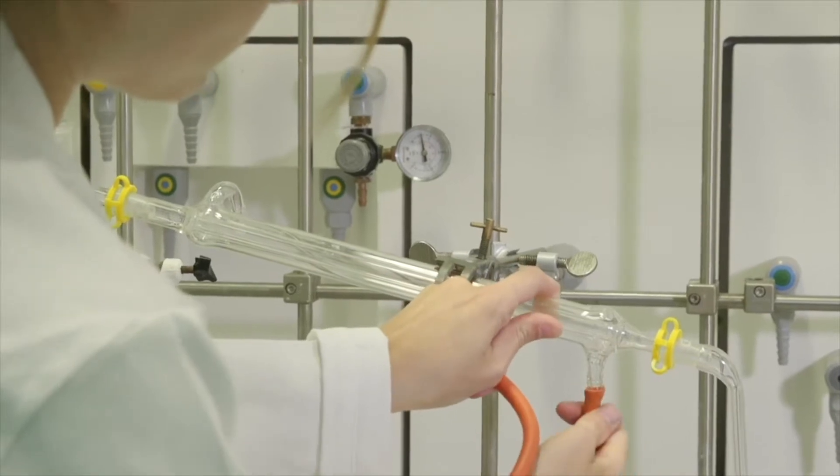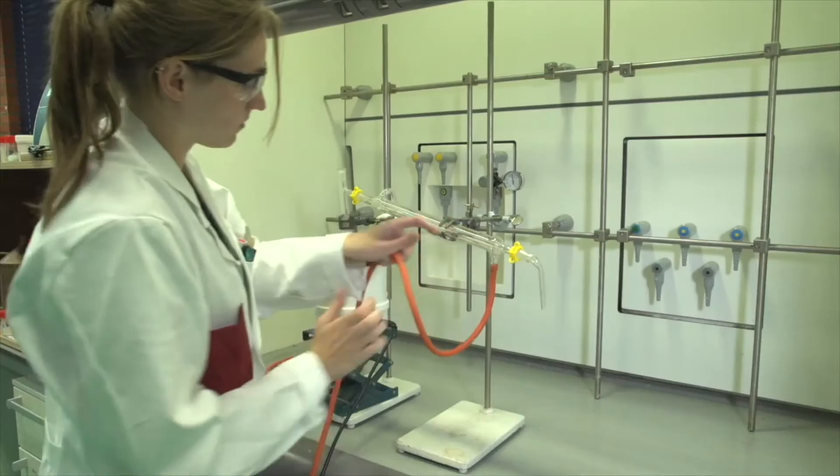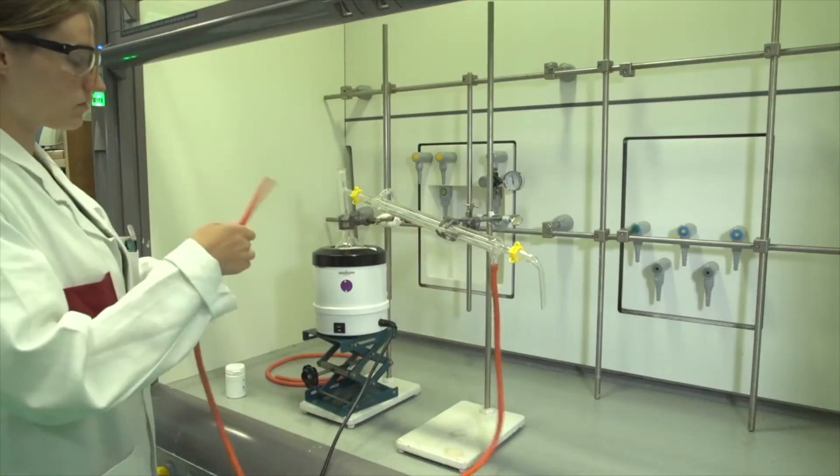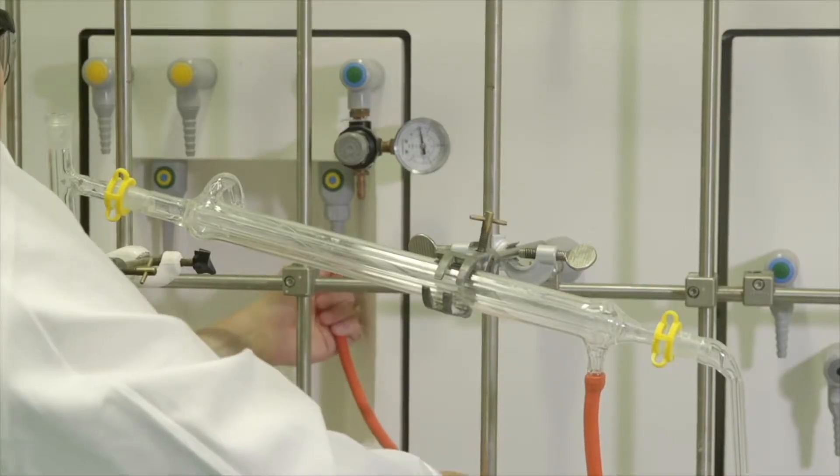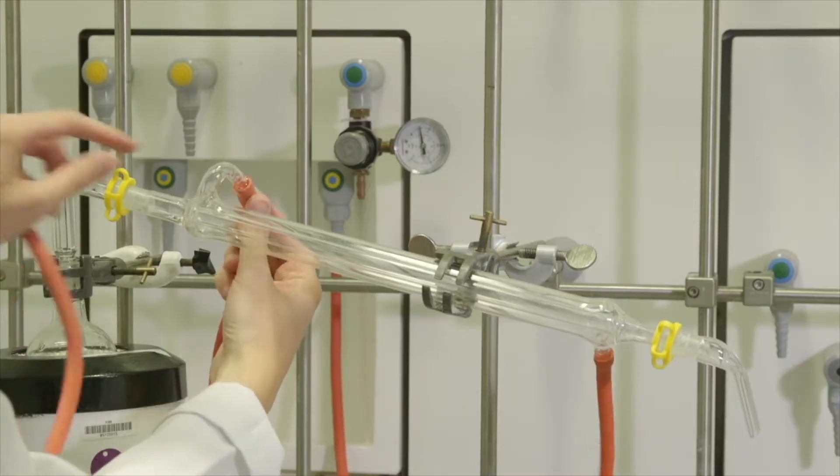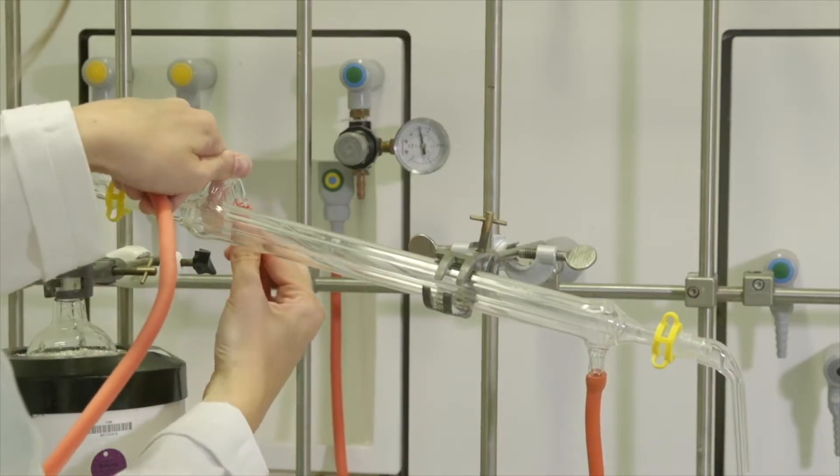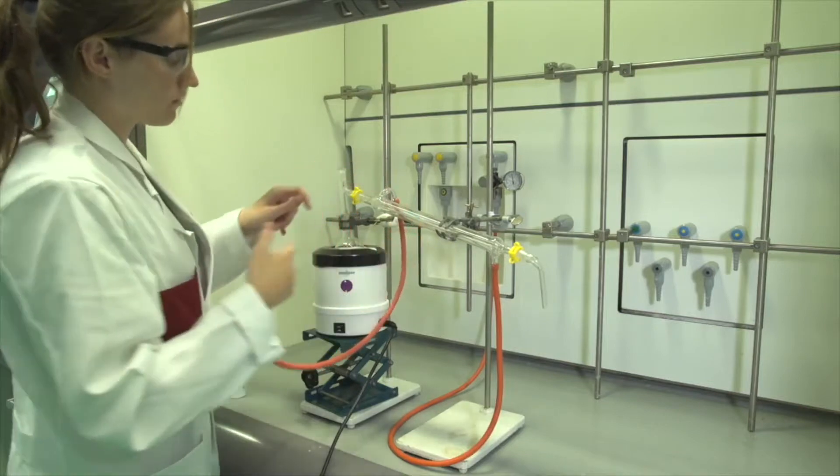Attach a tube to the lower port of the condenser. This is where the water will enter. Attach the other end of this tube to the tap. The water will flow when the tap is turned on. To drain the water, the second tube is attached to the upper port of the condenser and the other end placed in the sink drain.